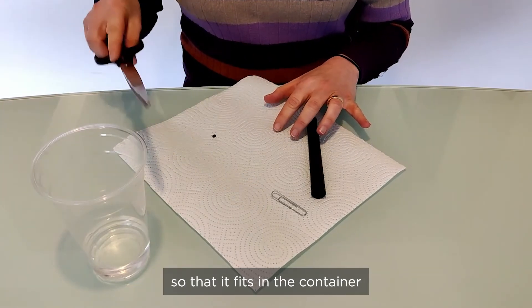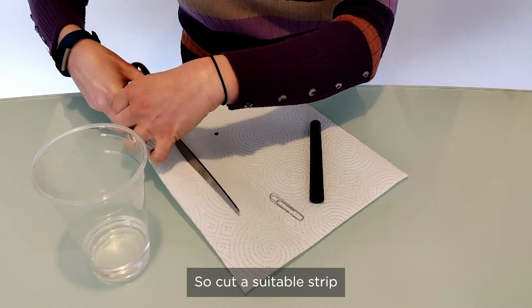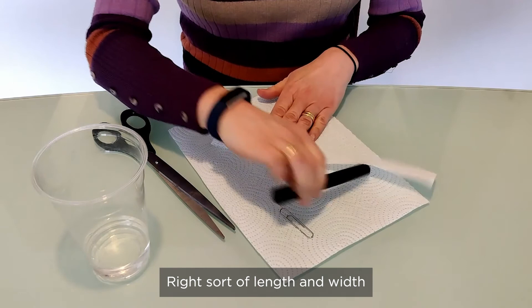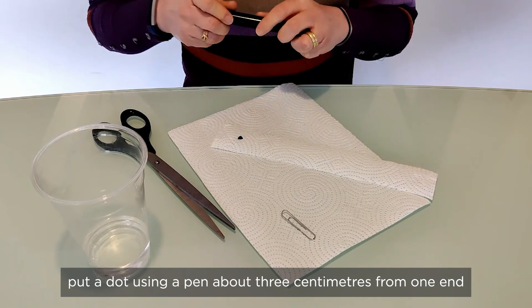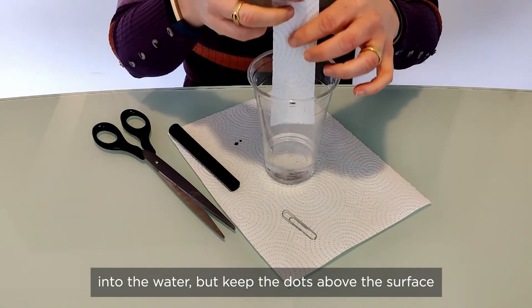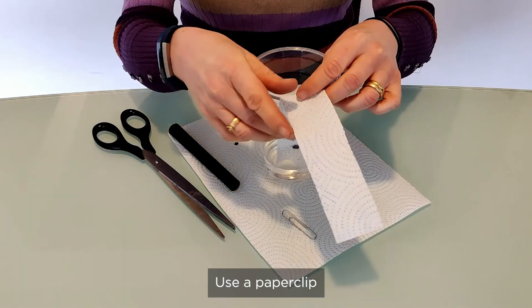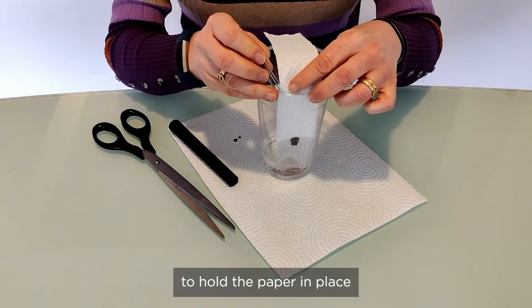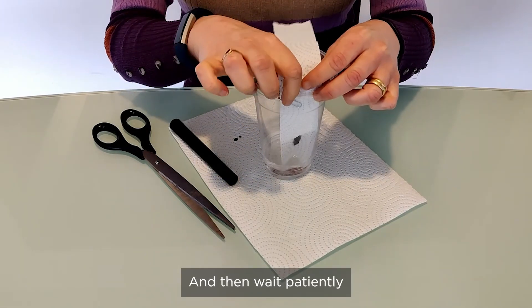Use a strip of paper so that it fits in the container. Cut a suitable strip of the right length and width. Put a dot using a pen about three centimeters from one end. Put this end of the paper into the water, but keep the dot above the surface. Use a paper clip to hold the paper in place, and then wait patiently.